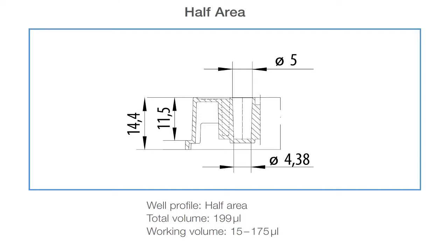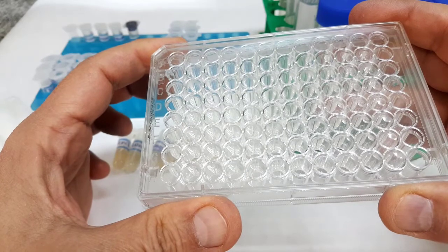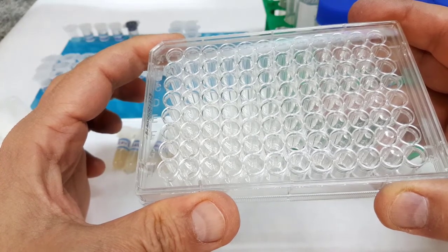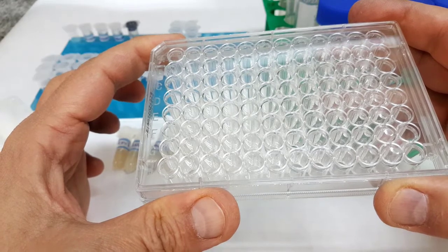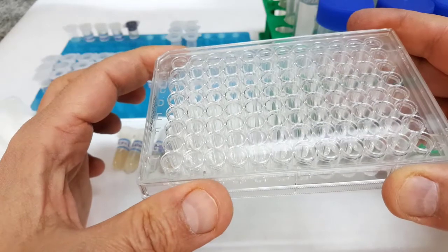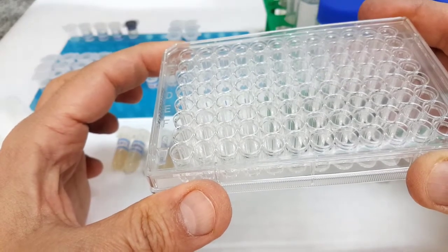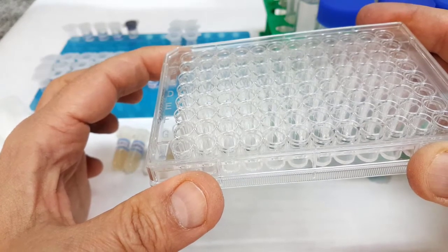For spectrophotometric applications, clear standard F-bottom plate is suitable. I used a biofilm polystyrene clear F-bottom 96 well plate for my work. The recommended working volume range of the F-bottom 96 well plate equals 50 to 250 microliters per well. Please pay attention that the dimensions of wells and therefore well total and working volumes of 96 well and other multi-well plates of different companies differ slightly.